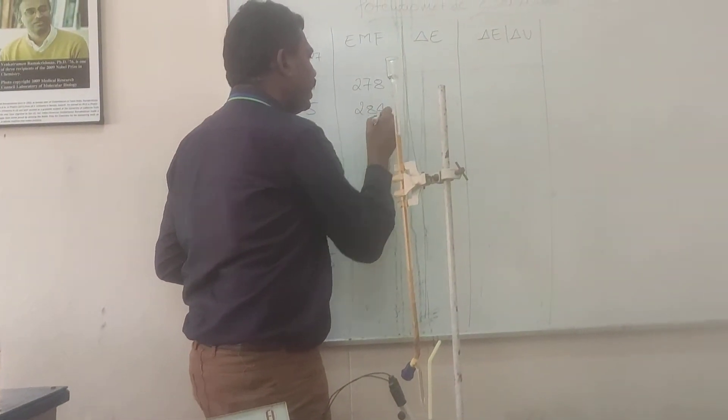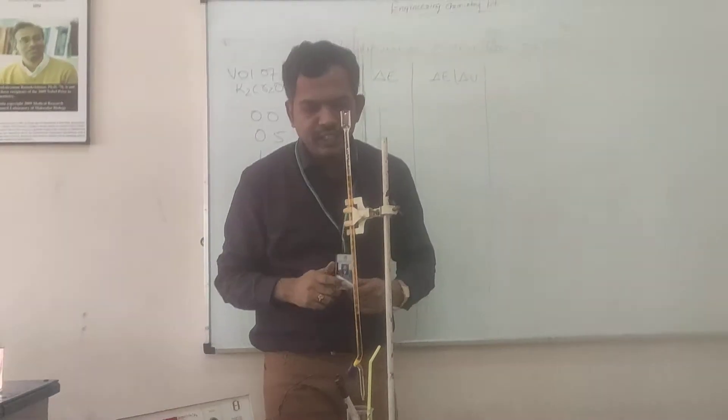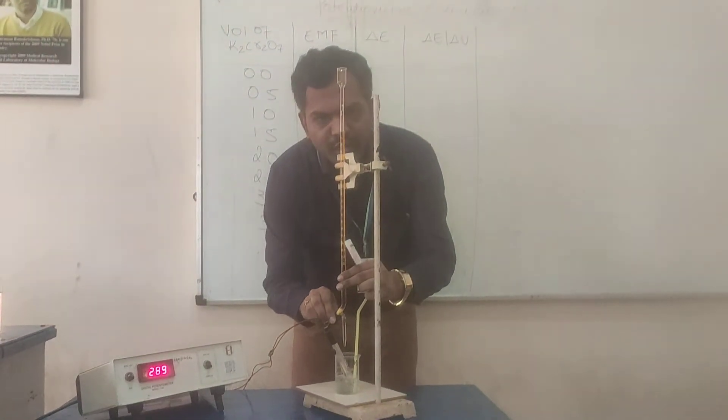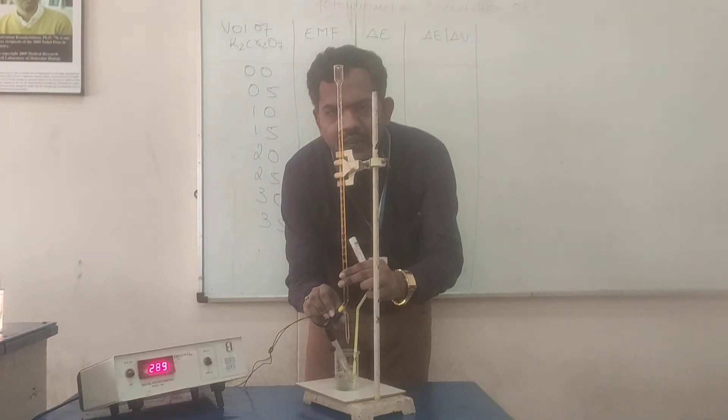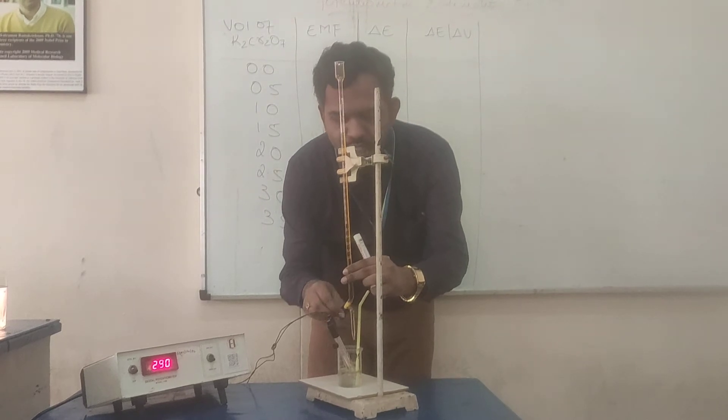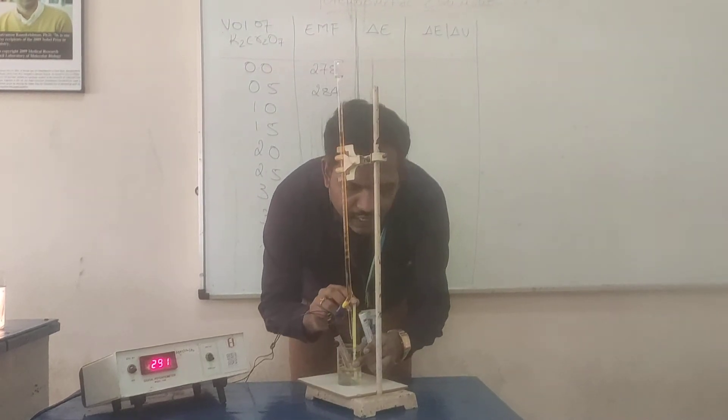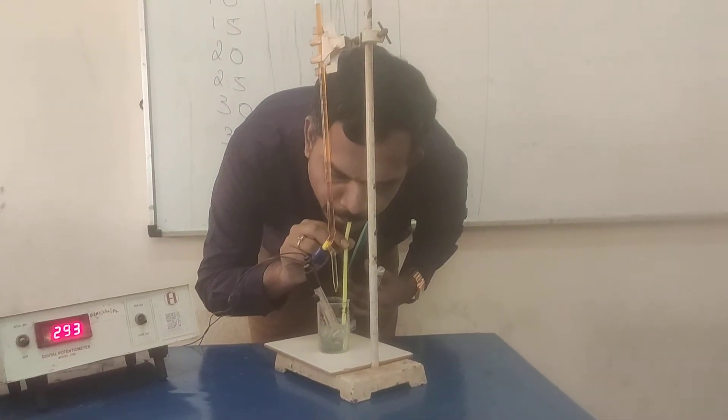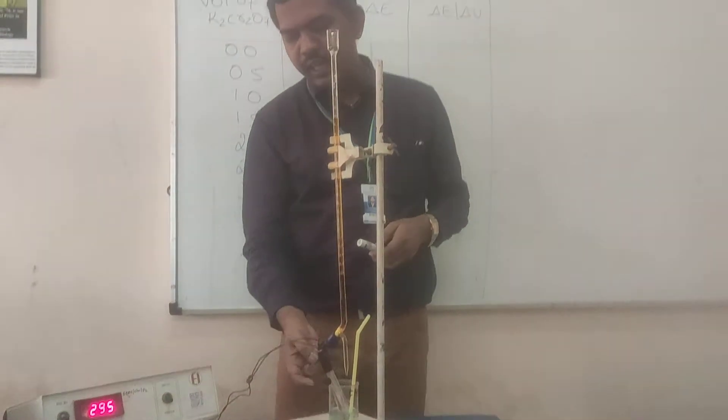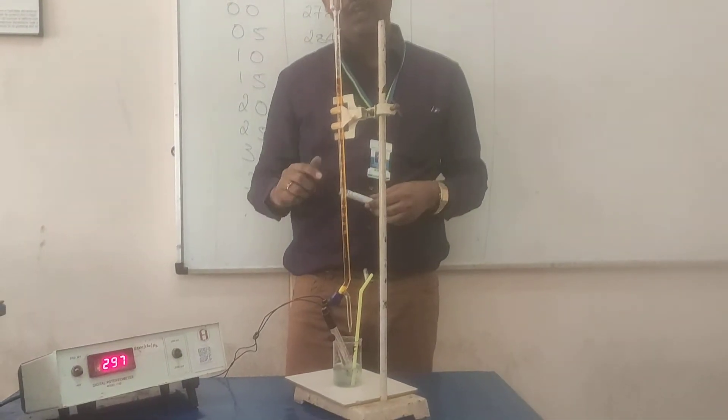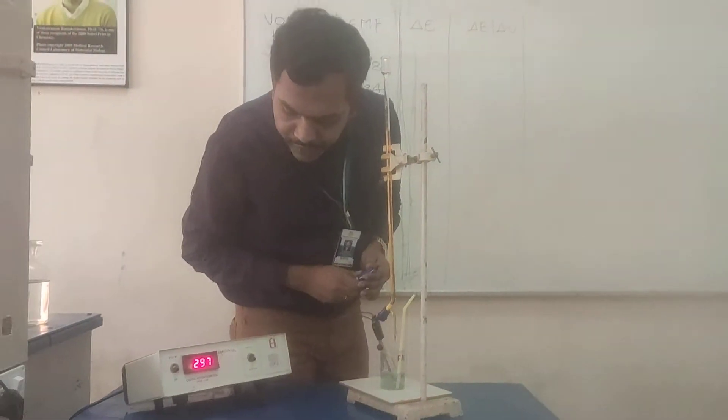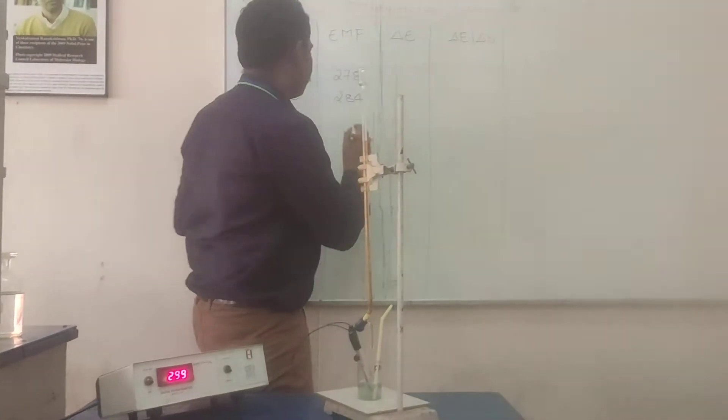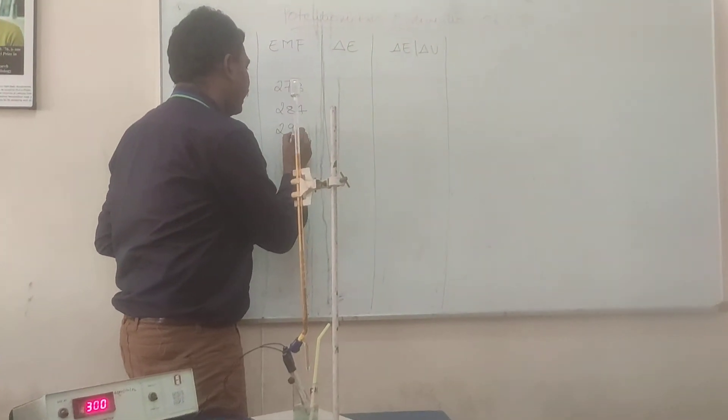So, similarly, we can add potassium dichromate in increments of 0.5 ml until you get sudden jumping potential. See, this color intensity will, as oxidation increases, the intensity of this bluish color also will increase and EMF also will increase. It is 299.